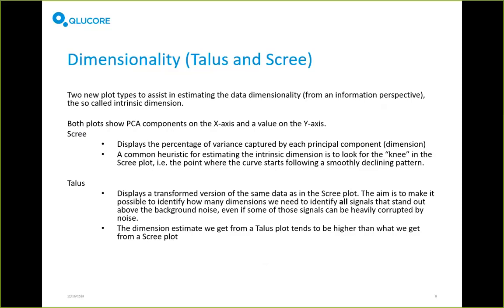This also gives me an idea of the number of degrees of freedom in a data set, because if I'm doing, for example, a controlled test where I have a control group and an experiment group, I expect very few degrees of freedom because I want to have control over this experiment, obviously. And if I then take up the scree plot, I expect to see a very steep scree plot, which means that I basically have few degrees of freedom.